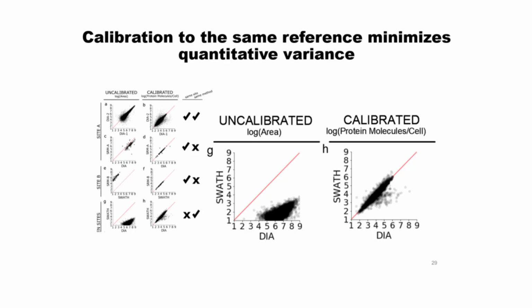Yeah, you prep it every day. So every day you get a batch of 10 samples or 20 samples come in, you take one of the reference samples out and you prep it with it, and then you measure the 11 samples. We often actually have 2 references in our lab, and one we calibrate all the samples with, and the extra reference we use as a QC, and we know that the changes relative to that reference are always going to be the same. So if we don't see the same changes relative to that reference in that QC sample every day, we throw out the batch. We say there's something wrong.